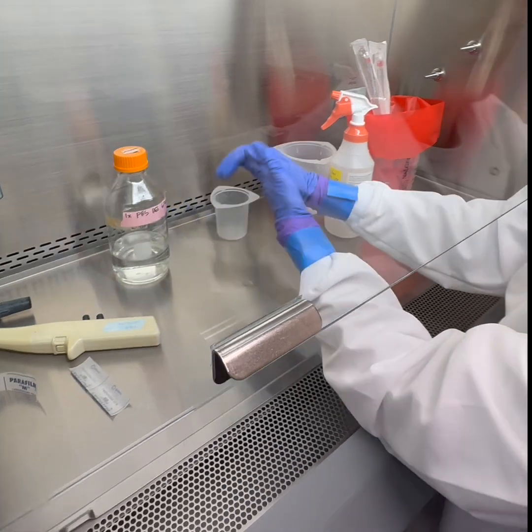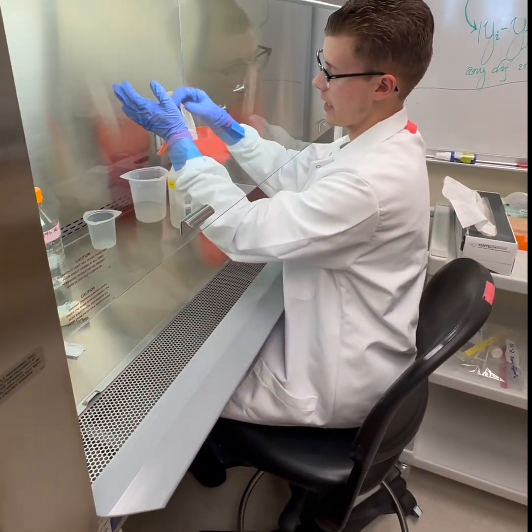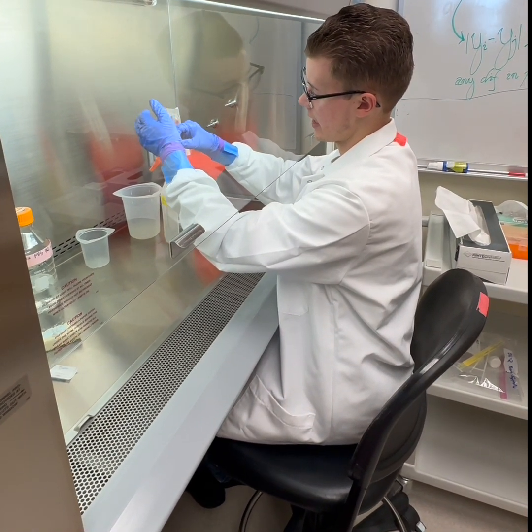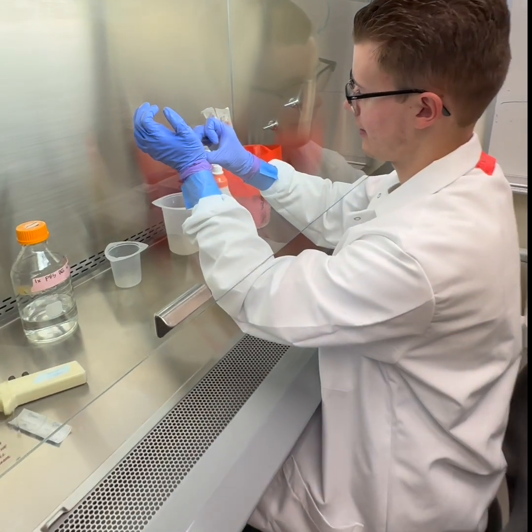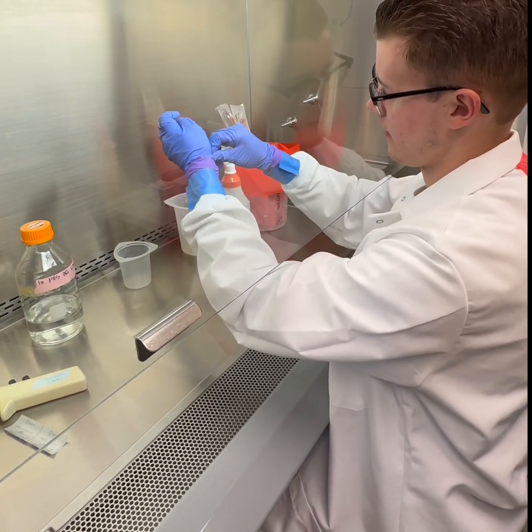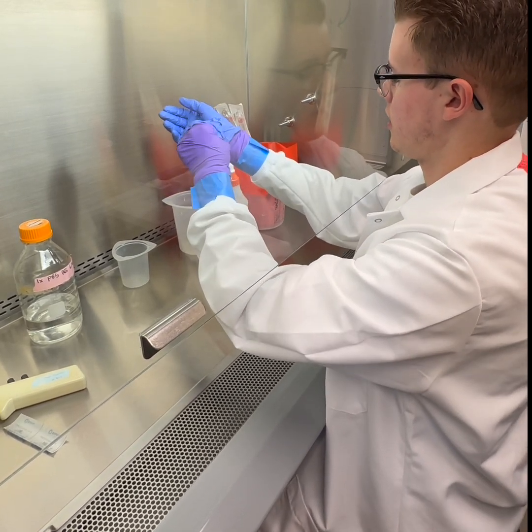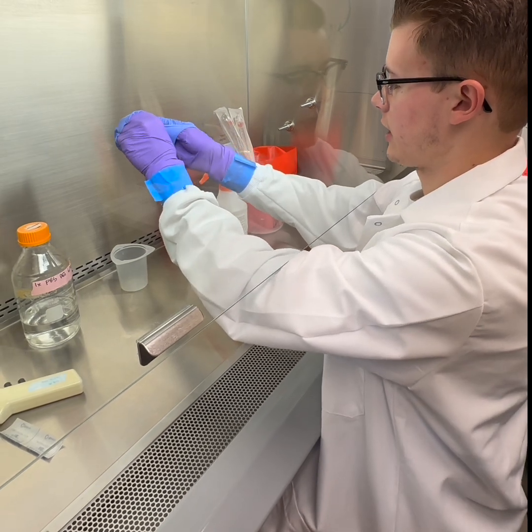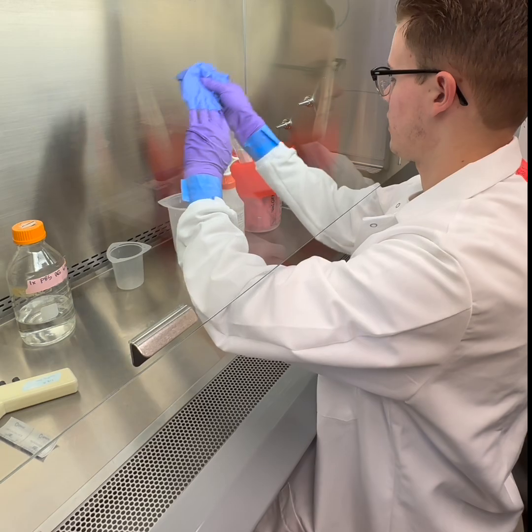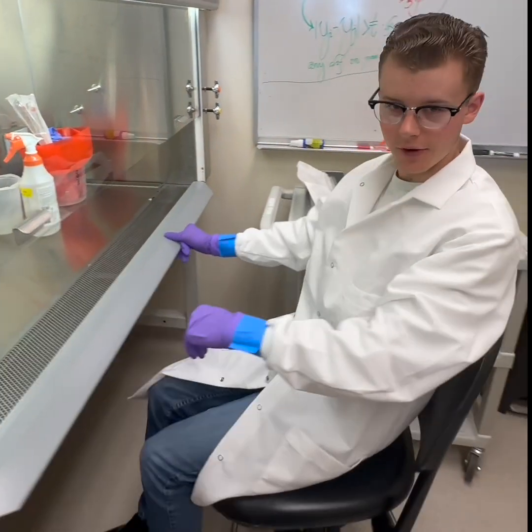Thank you. And then when you're coming out of the hood, you want to spray your gloves down and doff using the technique that you learned. So you don't want to touch your second pair of gloves. That's why we use this technique. All right, you're going to put them in there, come out, and voila.